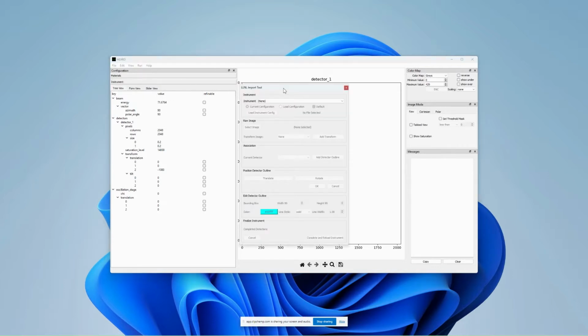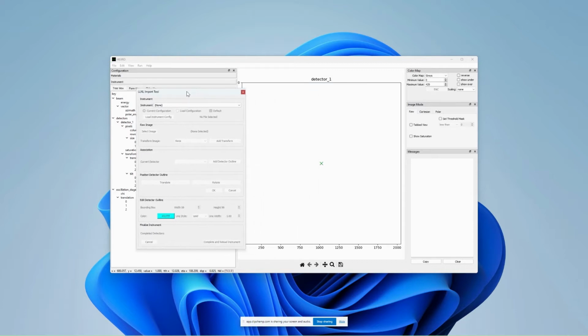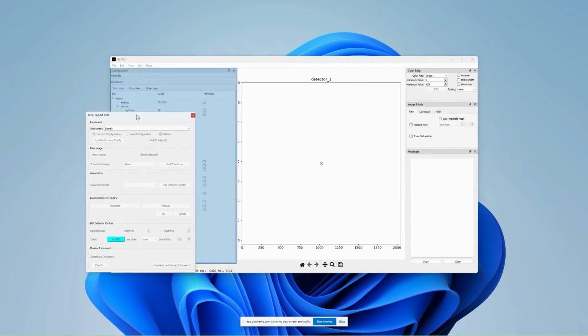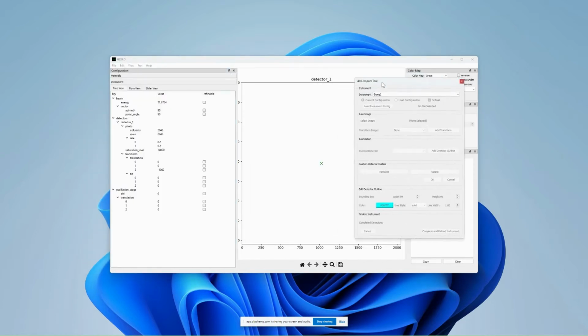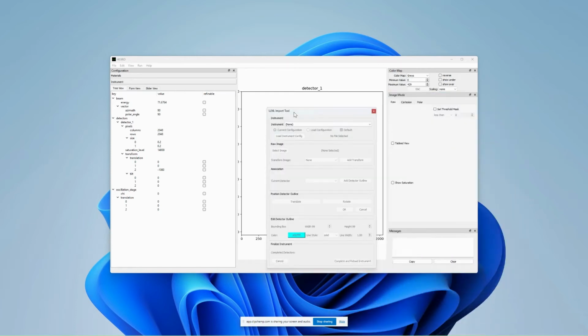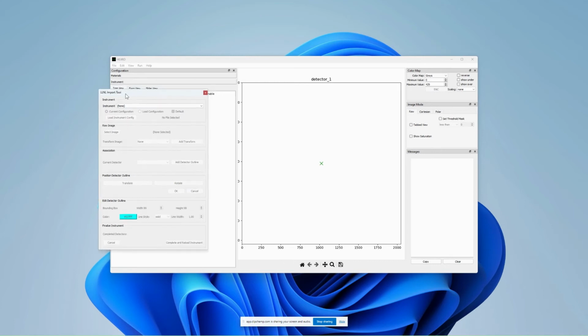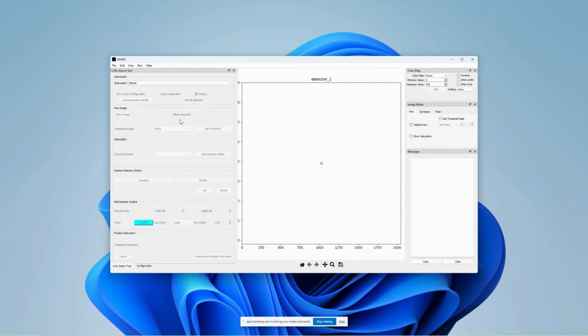When I hit that, it brings up this new widget with the same name that is laying out a serial workflow for getting the raw image data into the program and associating it with the right detector object. On a practical note, I strongly recommend that you dock this widget in the main window. You can dock it wherever you want. If you drag it around, where it starts looking dark like that, it means it's going to slurp it into a tabbed widget wherever your mouse is hovering.